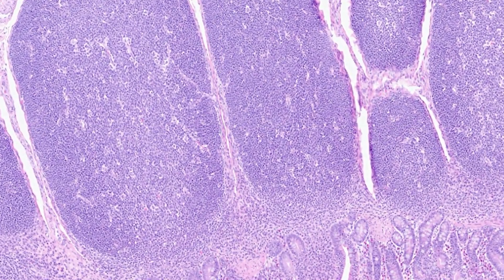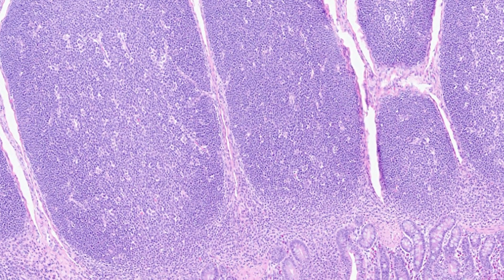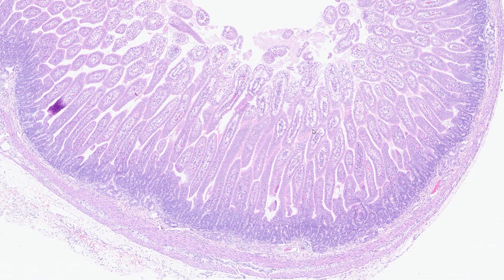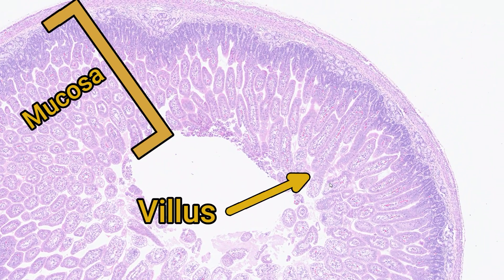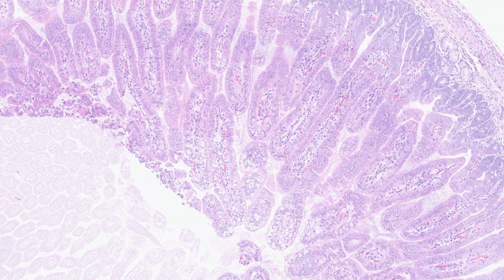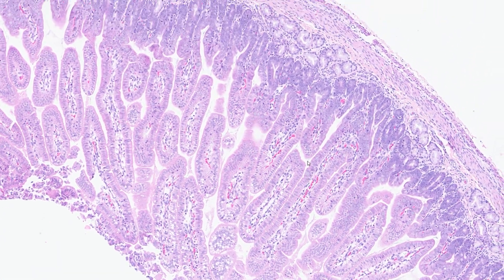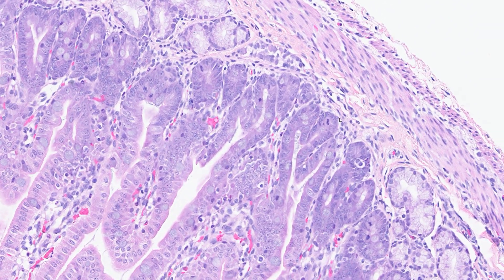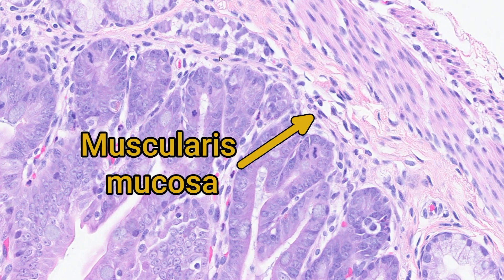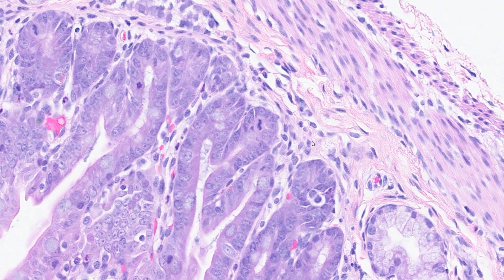Let's first study the basic structure at low and high power. At low power we can see the main distinguishing feature of the small intestine: the mucosa is highly folded, forming finger-like projections into the lumen. These are the villi. Underneath the villi there is a layer of smooth muscle called the muscularis mucosa, though it's not particularly obvious in this section.